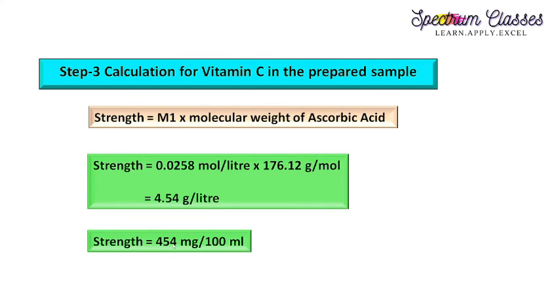This is very close to the value given on the tablet wrapper, that is, a 500 milligram tablet is dissolved in 100 ml of the solution. So I hope you understand this back titration method, how we can perform it and what the calculations are, with detailed concept.